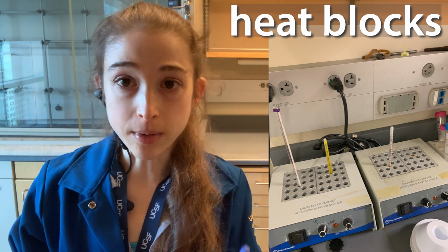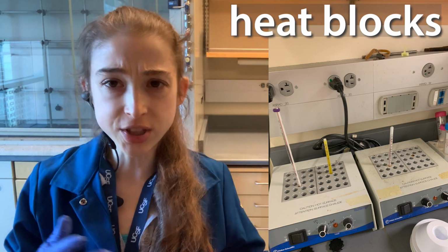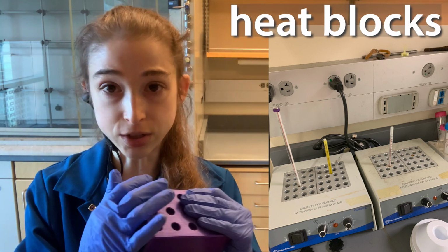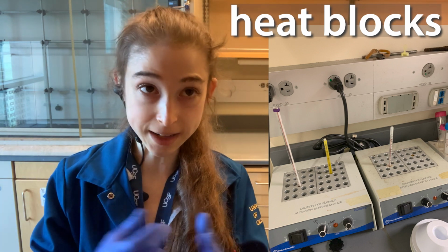What's really great about the thermal shaker, the heat blocks, the PCR machine and all this stuff is that the whole thing around the tube is heating up, and so you should get more consistent heating.